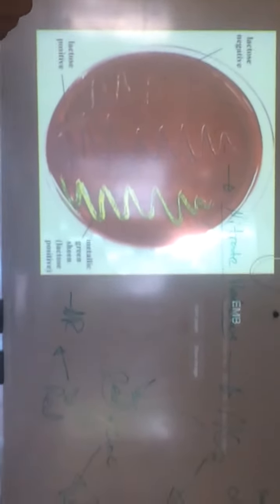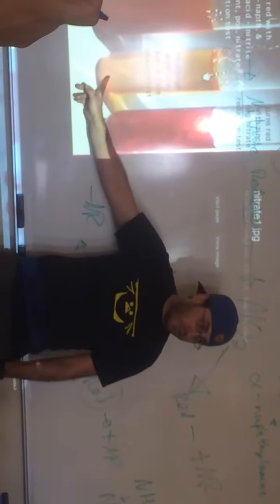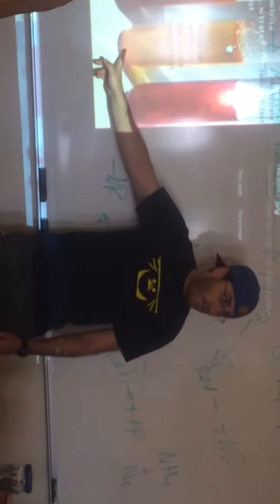I've done ones before where all the words are gone. There's an arrow pointing to this. Is this negative or positive for nitrate reductase? Would it be positive?